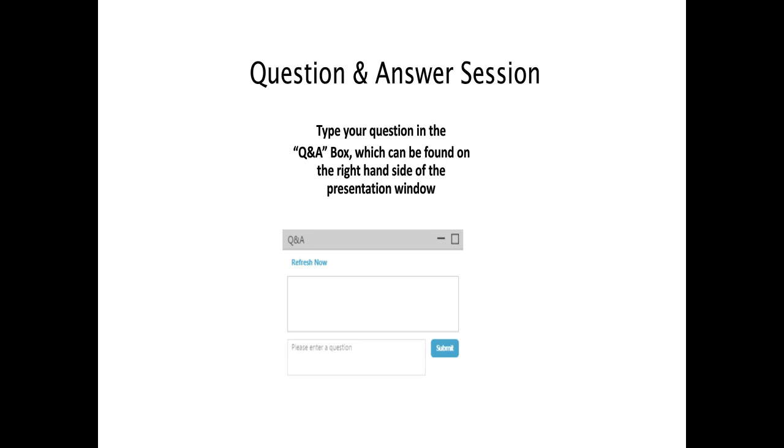Thank you very much indeed for the question. So, can we develop a HILIC method on a reverse phase? I don't see why not, of course, but bearing in mind from what we've seen that we would expect a reversal of elution on reverse phase generally. So obviously that is something that you would need to consider.